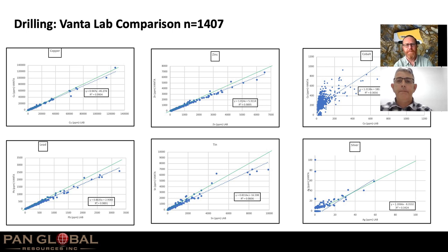Yeah, that's right. If I was working on cobalt deposits, I'd want to get my head around it. We have had some success in a deposit style that has consistent iron, and I know the guys in Australia have done a fair bit of work on that and put out some decent numbers. But you should definitely be wary of the instrument's ability to routinely do cobalt.